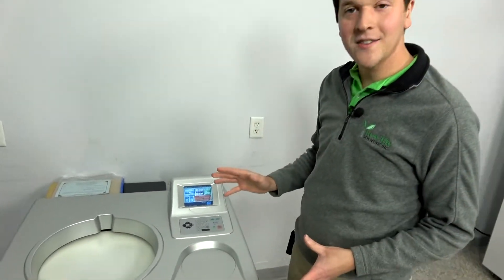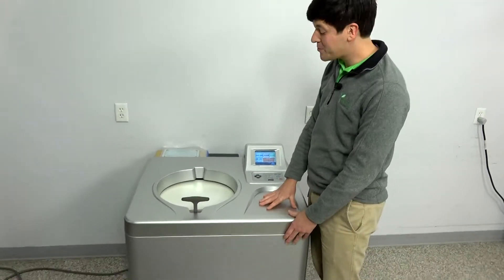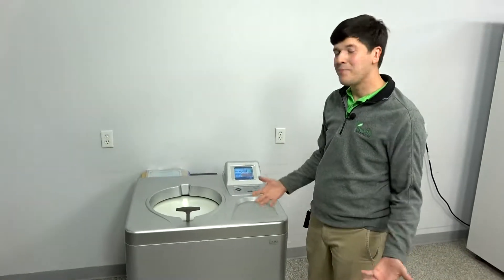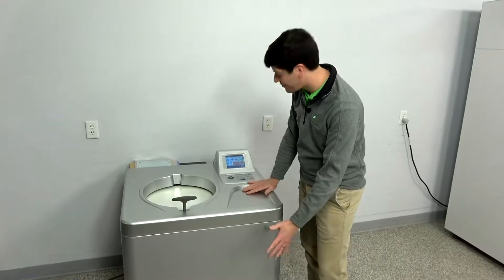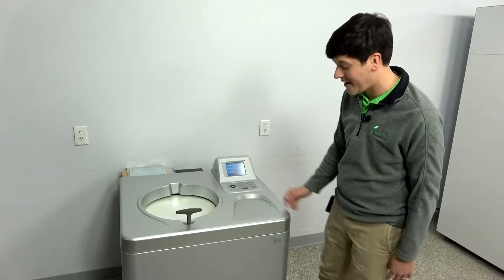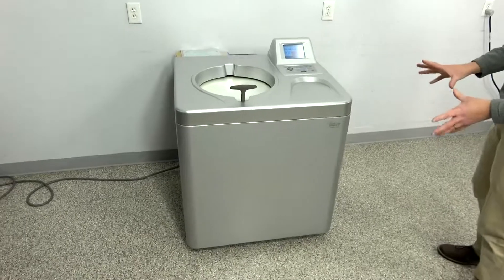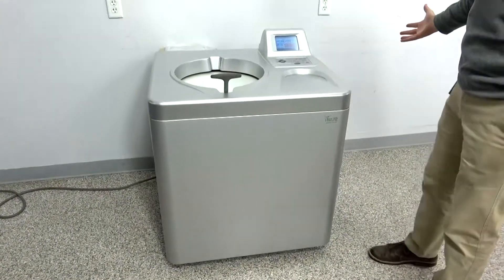This came to us with a little bit of cosmetic damage on the top and the front, which might be why it was never used. Somebody got it and thought, 'I just bought this new centrifuge and now it's got a ding in it.' So we replaced the top panel, the front panel, and it's got a new keyboard — it looks as good and as unused as it actually is on the inside. Don't be scared by the lack of sticker on the front; apparently Thermo ran out of stickers before they ran out of front panels.